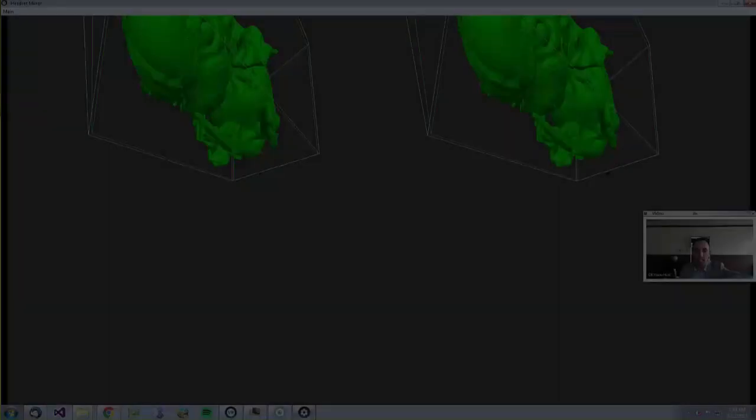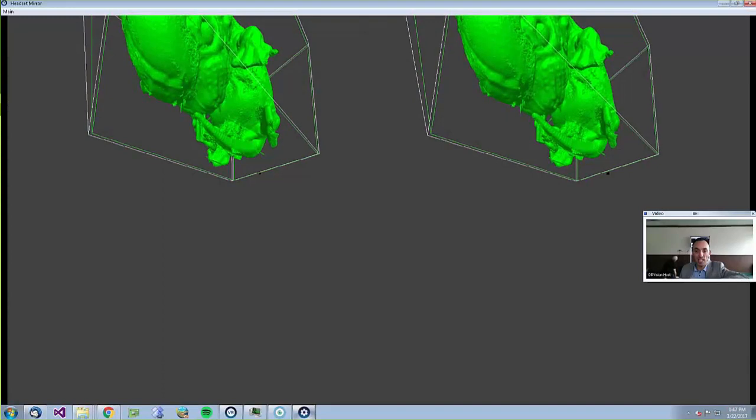I think now I'll probably go and show you this data set, and then we'll be just taking questions and discussing things with you guys.